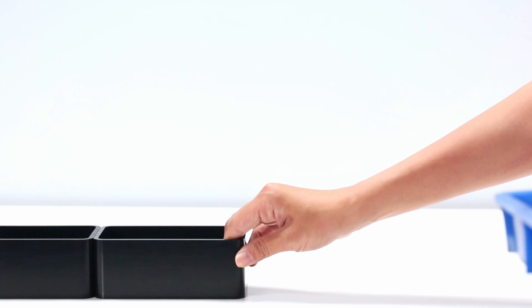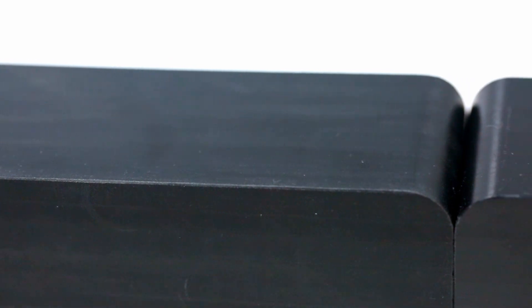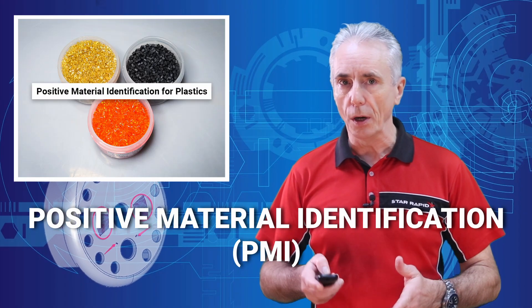Captioned here are seven black plastic boxes. Even to the practiced eye, each of these boxes looks pretty much the same, but they are in fact different materials, each with its own unique chemical and physical properties. So today's challenge is to find out which is which, and we're going to do that by exploring how positive material identification, or PMI, works.